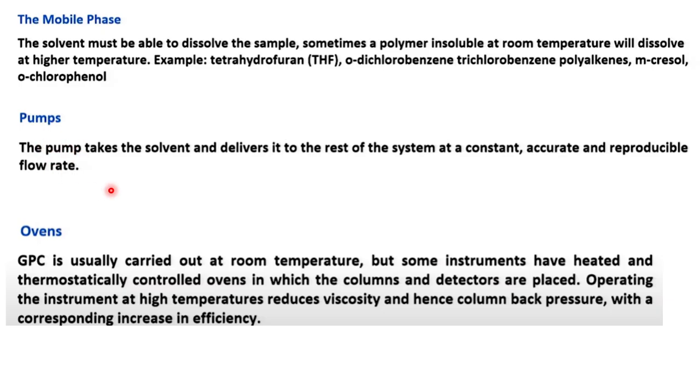And there is also a pump needed. The pump takes the solvent and delivers it to the rest of the system at a constant, accurate and reproducible flow rate. That may be 0.1 ml per minute to 1 ml per minute.